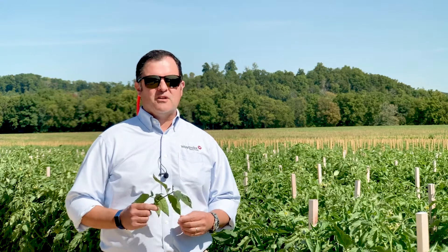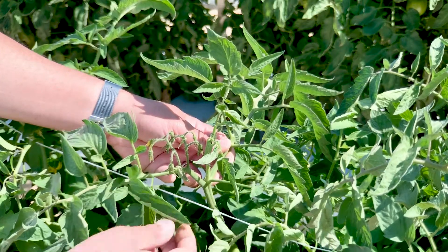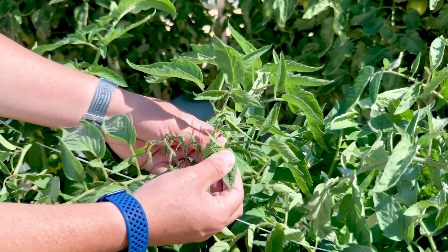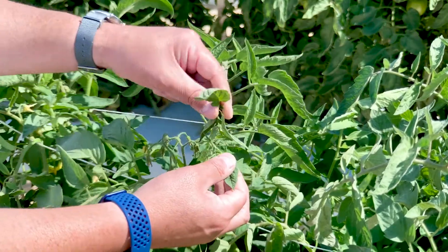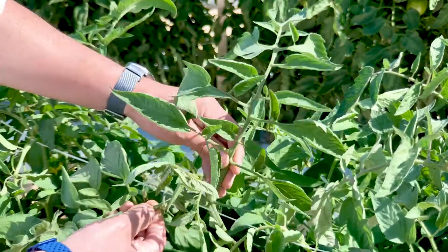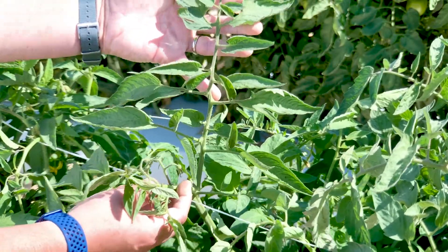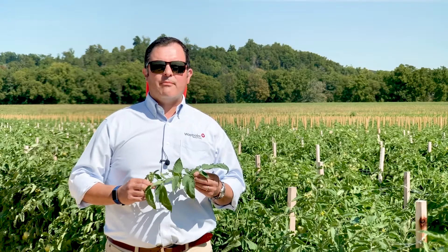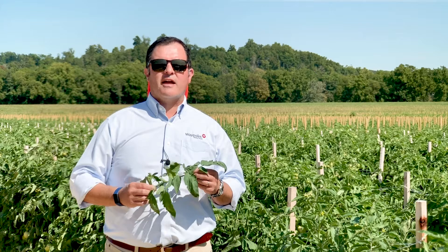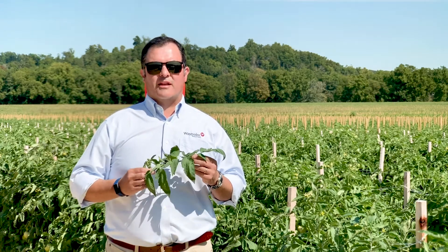To take a tomato leaf sample, you need to find the first developing leaf and then count down four leaves from that one — two, three, four. This fourth leaf from the top is your first fully developed leaf. The laboratory requires 25 leaves per sample to accomplish the nutritional analysis.